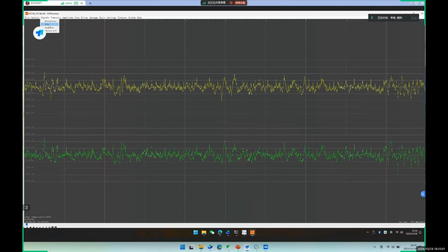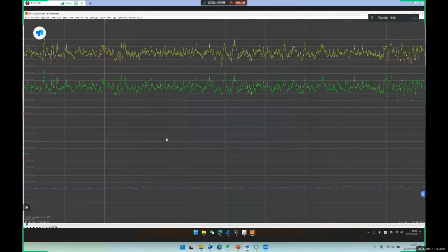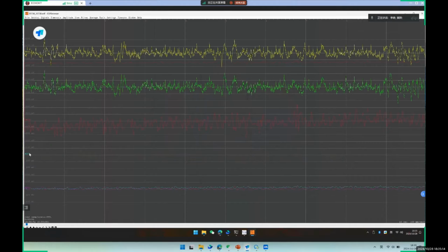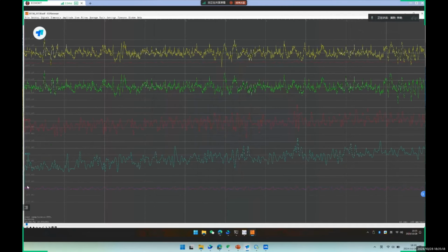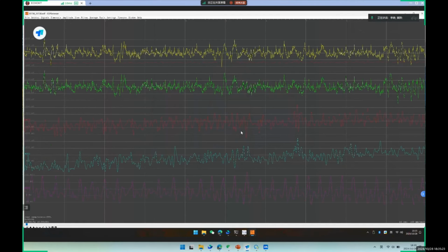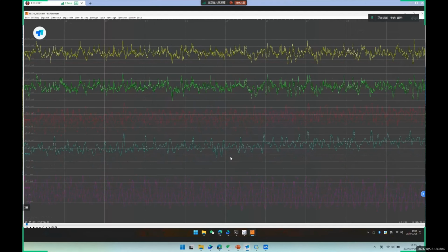The three ACCs below refer to the acceleration of the X, Y, and Z axis. They represent the acceleration of the mouse's movement. They are generally used for sleep stage analysis of mice, because sleep stage analysis requires three parameters: electromyography, electroencephalography, and movement. For other application scenarios, you can refer to the literature.